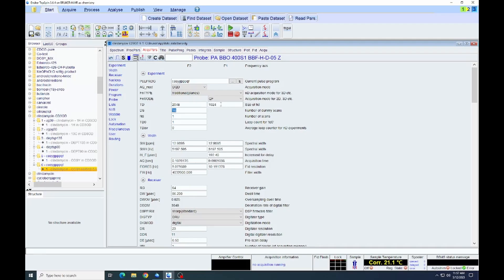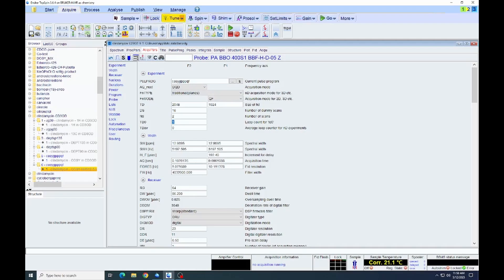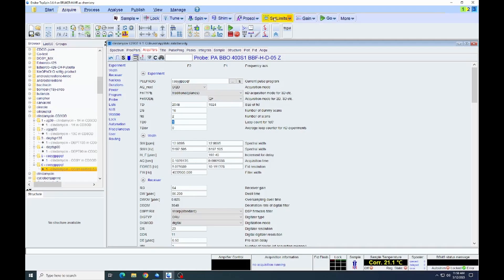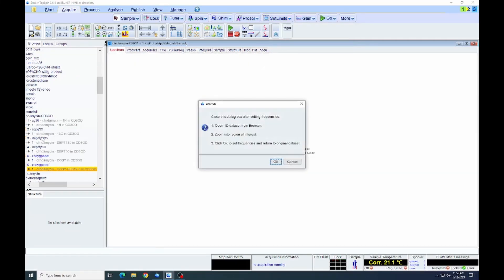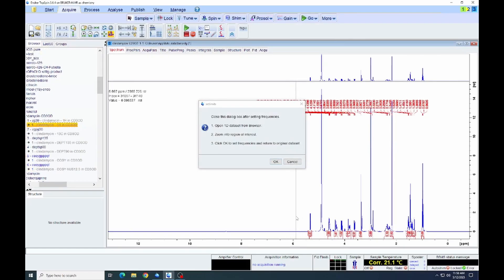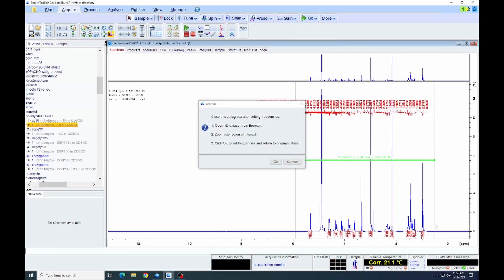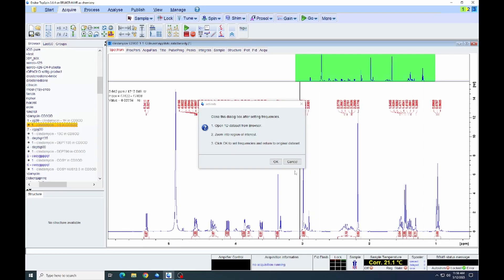We're going to change this to 1024. Number of scans is still going to be two, just as we had before. The spectral window is again, default is too large. So we will go to acquire and set limits. That will allow us then to change the spectral window. Again, we do it the same way. Load up the 1D, expand and click OK.